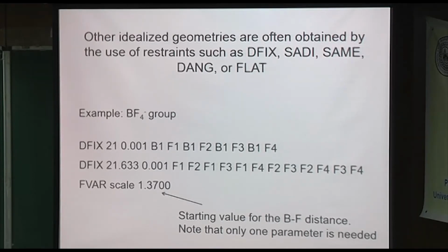So that gives a really nice result, and that's not a bad way to do a rigid group, actually. But this is a simple case. Some rigid groups are not so simple, like the whole molecule disorder that I showed you. You can take the same approach for PF6, SbF6, all kinds of things, AsF6. Anything that's octahedral or tetrahedral works very well.